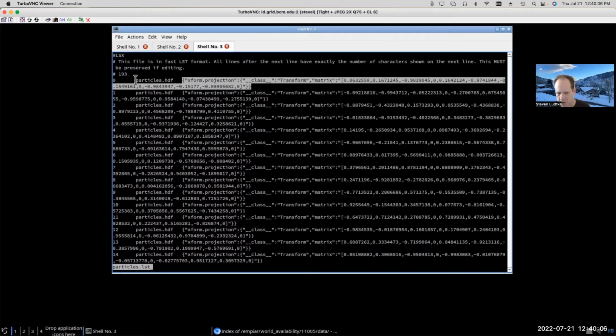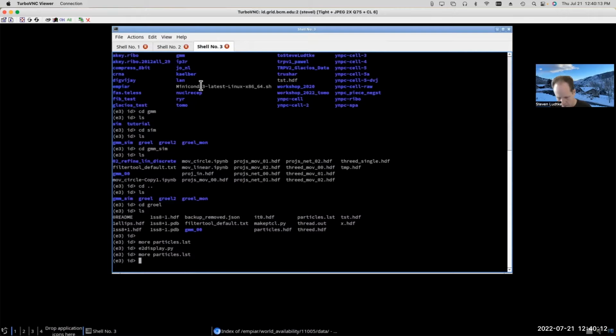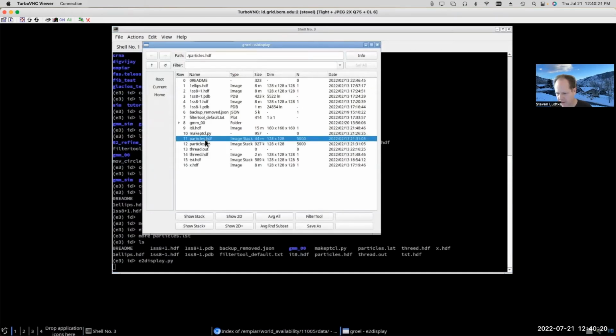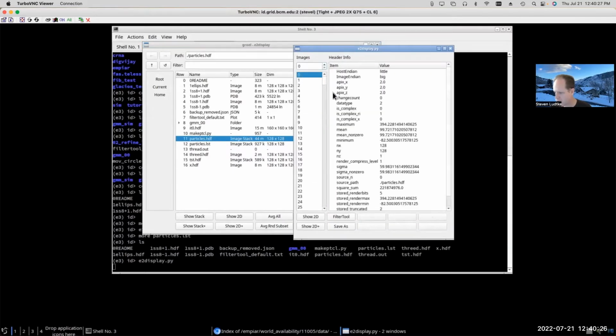So basically, each particle in the HDF file has header information associated with it. So let's look at the HDF file. The HDF file has 5,000 particles. If I hit info, I can then look at the header information associated with any one of these particles, right?